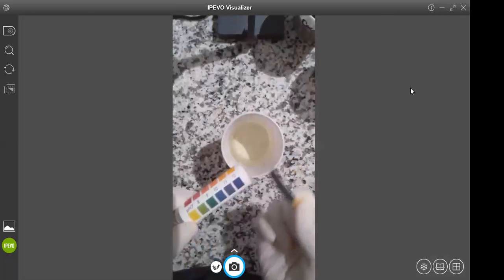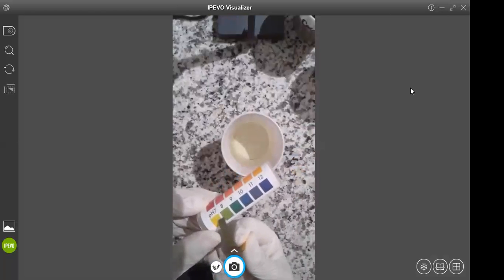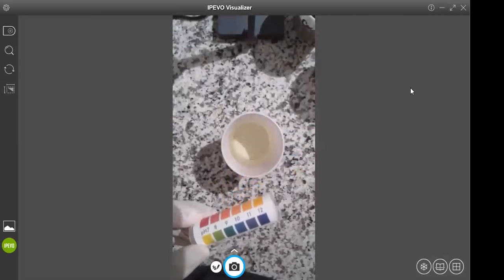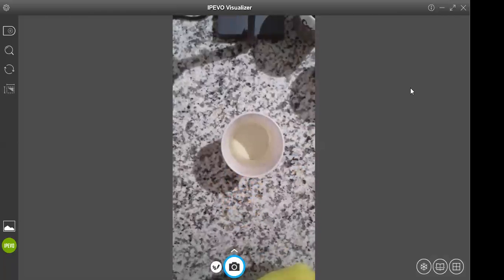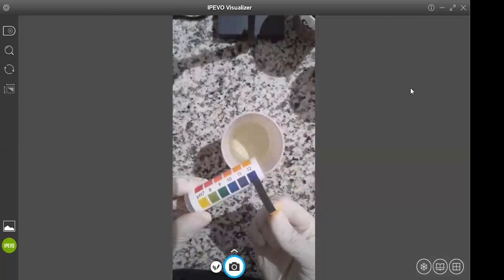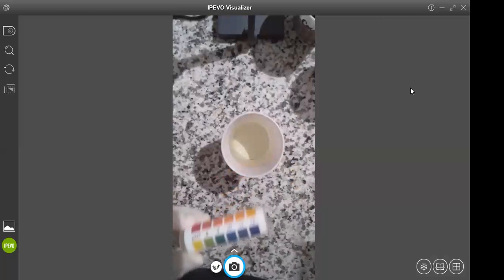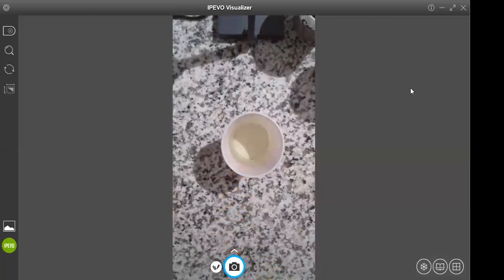When you initially dip it, it's really, really dark, and then it gets lighter really quickly. But we're going by the initial color of the pH strip. One last time, just for quick reference. Okay, so that was bleach.